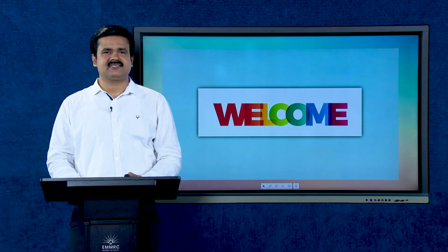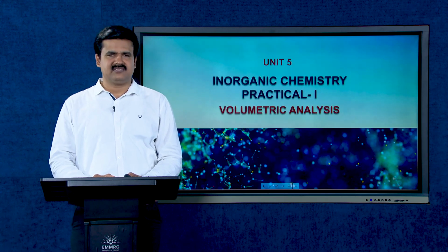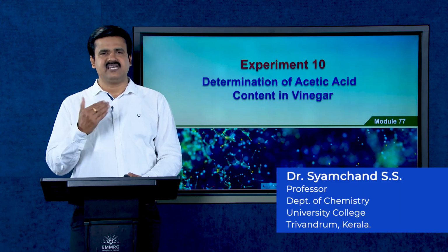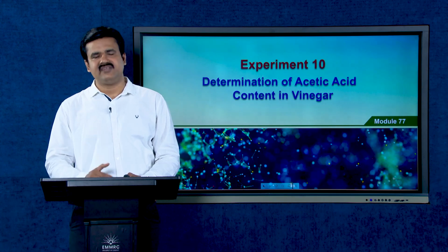Welcome dear learners. We are continuing Unit 5 Inorganic Chemistry Practical 1 Volumetric Analysis. In the present module, we are describing experiment 10, that is determination of acetic acid content in vinegar.